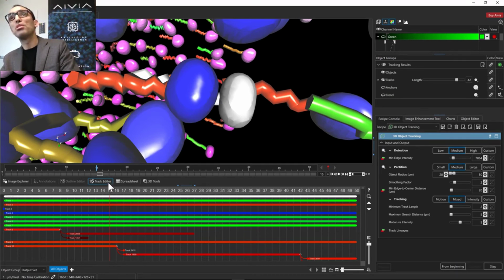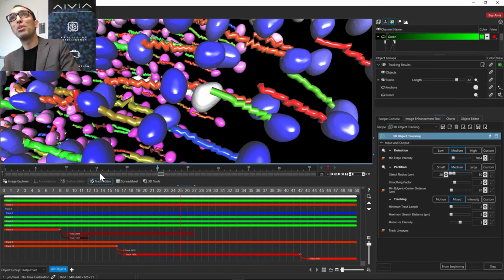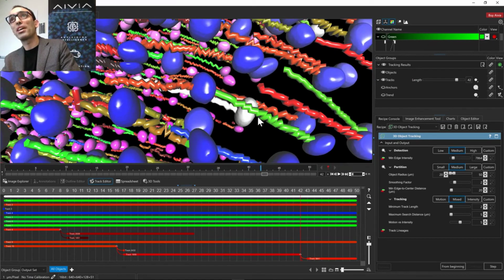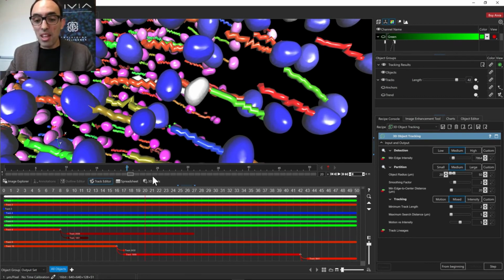And I play through, let's see if I can do that. It's actually going to follow that track, adjust the view as I follow the track. So you should never get to a position where your track is out of the view. I think I can't see if the button is on or off, so it might be off. So I'll show you that in a moment.